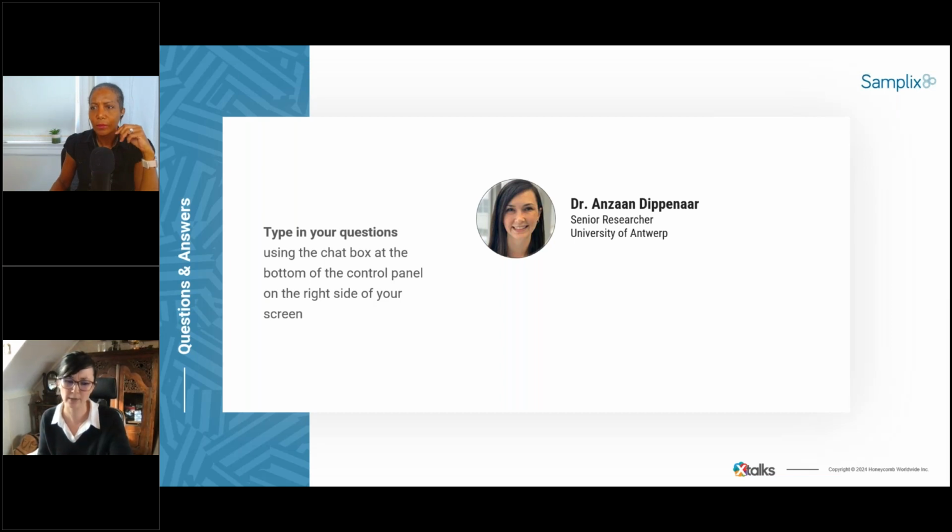And then also, as I mentioned in one of the previous answers, we're really interested in this selective sequencing or read-until function from ONT that could potentially help to overcome the dirty or contaminated samples. I think it is probably going to take a combination approach, because MTB is quite special, and I don't mean that in a good way. It really throws complications at the research in every possible term.